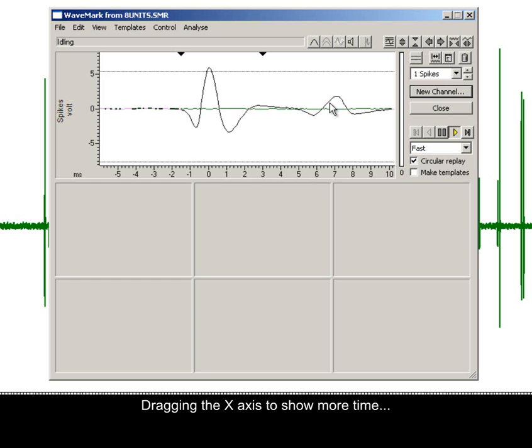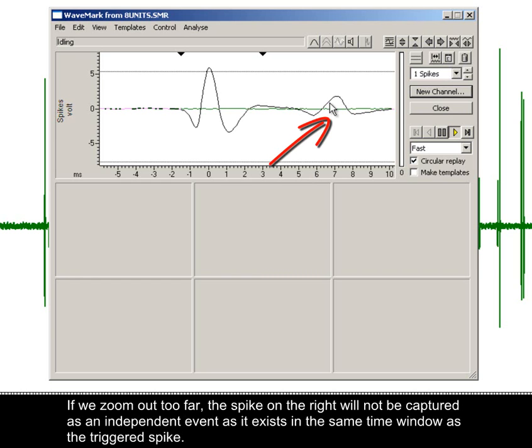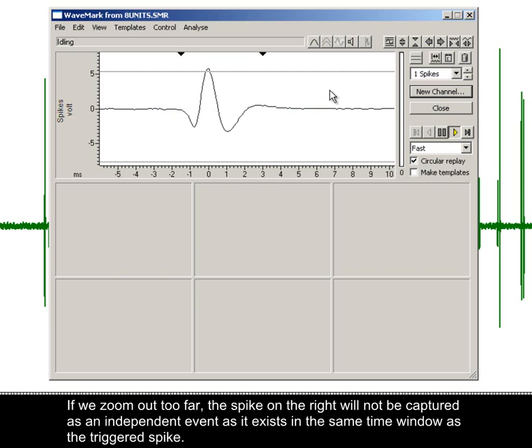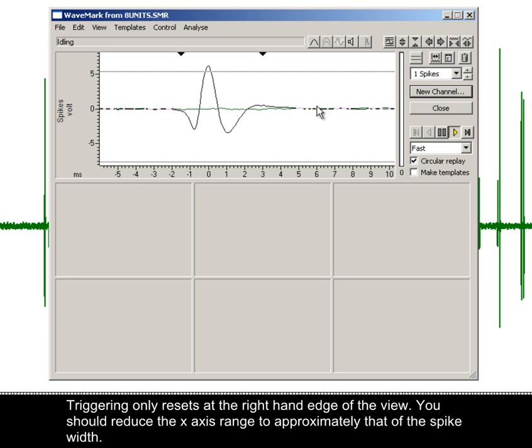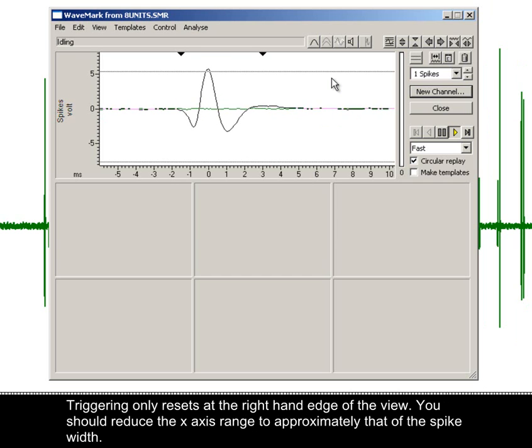Dragging the x-axis to show more time. If we zoom out too far, the spike on the right will not be captured as an independent event, as it exists in the same time window as the triggered spike. Triggering only resets at the right-hand edge of the view.